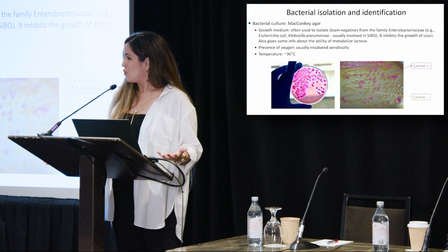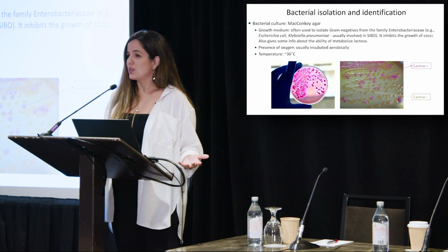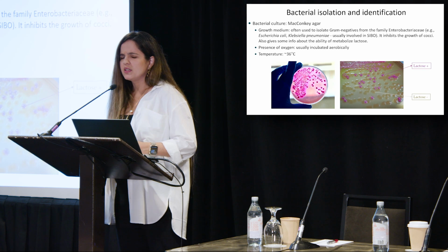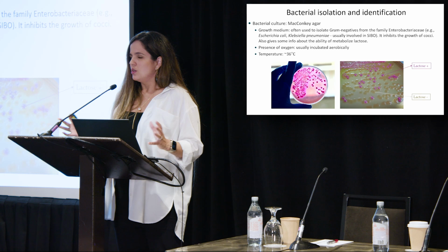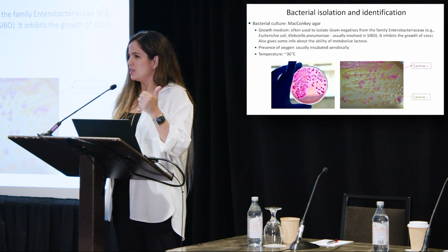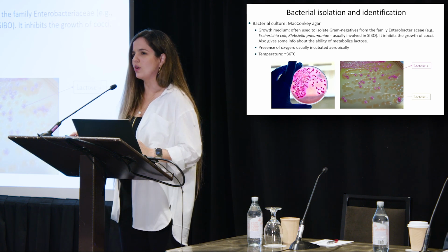And it is very important for us to know that they are using lactose, and they have all the genetic machinery to break down lactose. They do more than that. I will show that to you. And then we have other microbes that don't like lactose. They don't use it. They don't have the machinery. And actually, in terms of pathogens, those that don't like lactose are the ones that we are concerned about, right? So usually Salmonella and Shigella don't use lactose. They will show in the agar as these little yellow colonies.